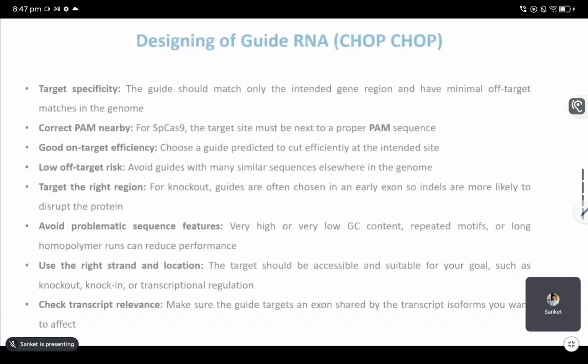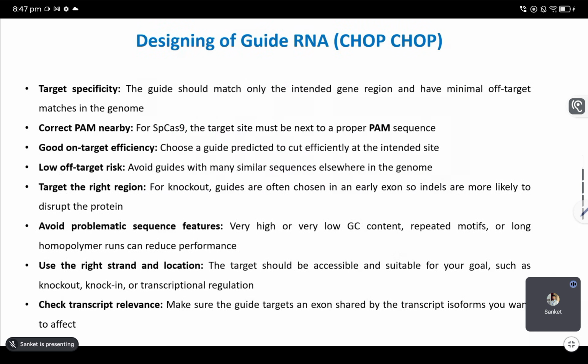Alright, so moving forward, let's see how to design a guide RNA.